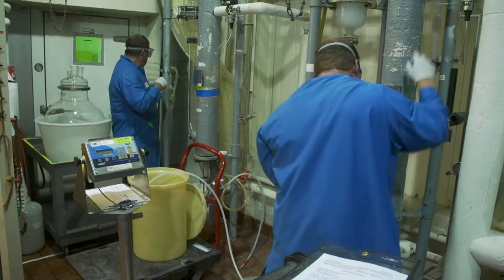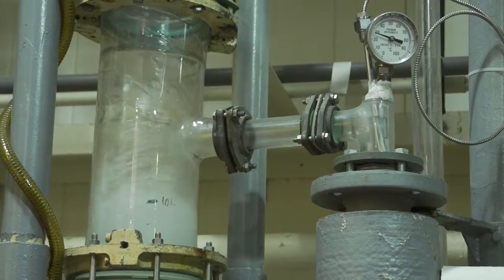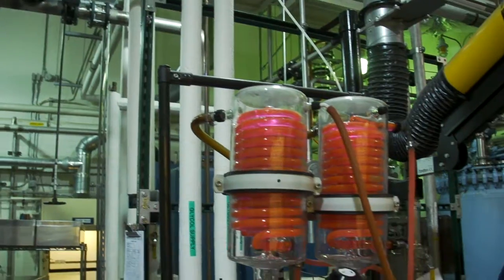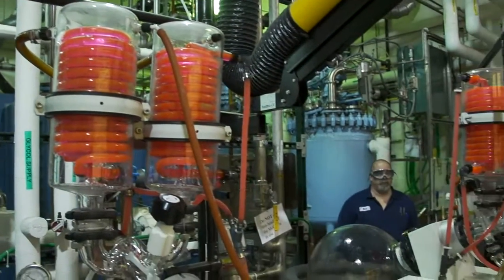The manufacturing suites were designed and built to meet stringent safety standards, with all equipment rated as explosion-proof, including reactors, ovens, and rotary evaporators.